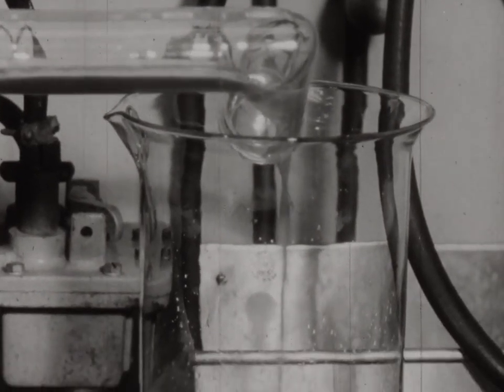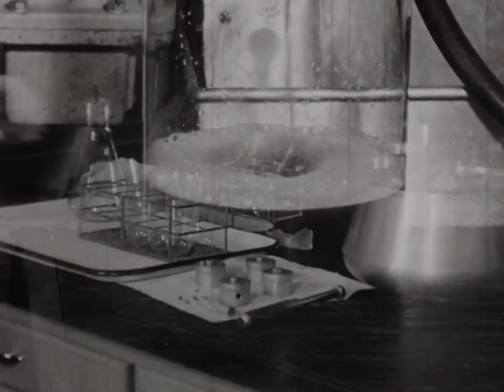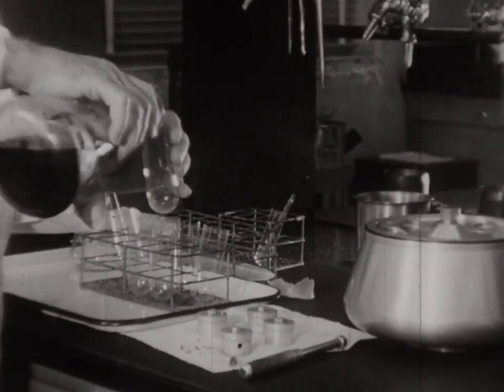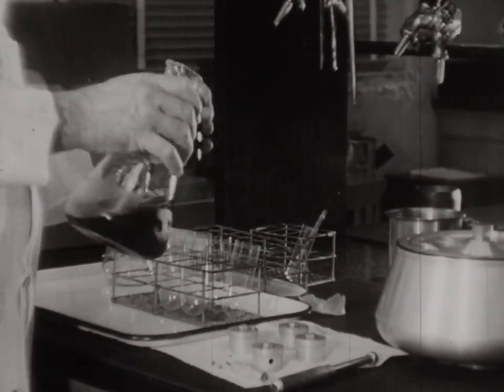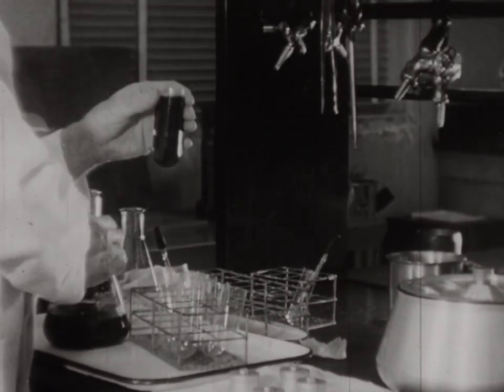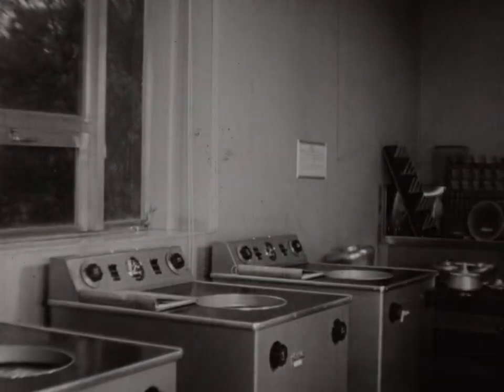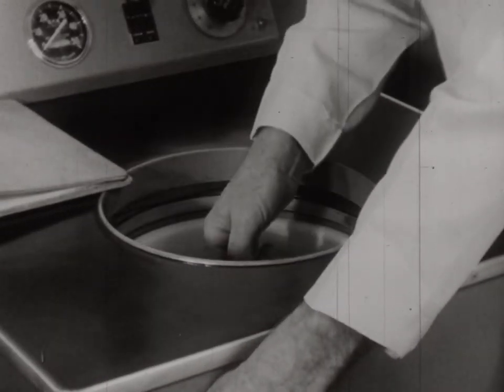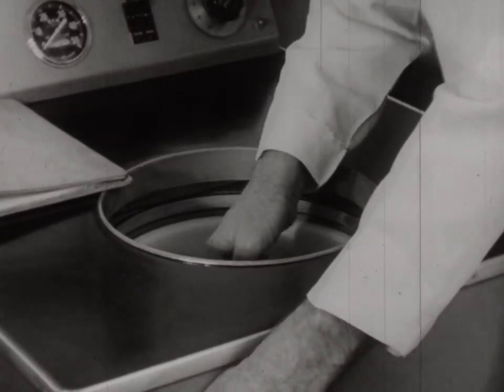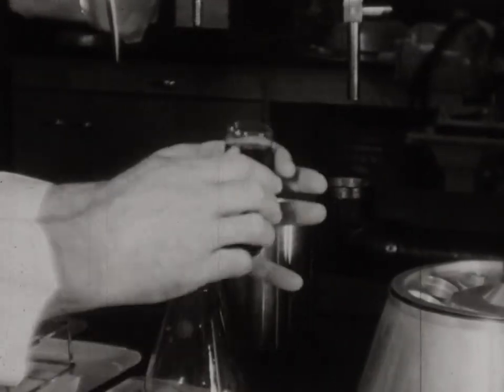We now want to spin the virus particles out of this fluid, separate them from the water and from the salts and the plant pigments, and we do this by using a high-speed centrifuge. We pour the juice into little tubes, and these tubes are then put into the centrifuge rotor. We're going to spin the centrifuge at about 40,000 revolutions per minute. The rotor goes into the centrifuge, and in the course of about an hour, we'll find that all the virus particles have been flung to the outside of the tube.